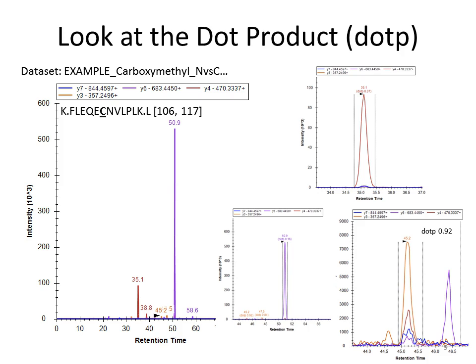But if you zoom in on these, the one at 35.1 minutes, which is the first one, has one very large intensity, and the others are really, really small. But the dot product's 0.37. The really big one at 50.9 is enormous, and it has a really big one and a second transition, but not anything from the other two. And its dot product is 0.16. So I would definitely not want to use that one.